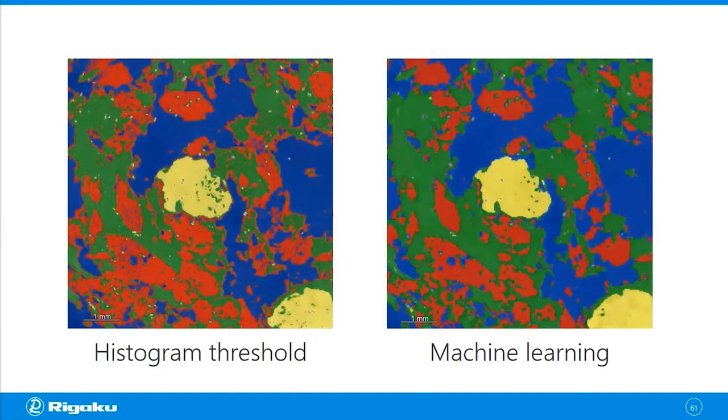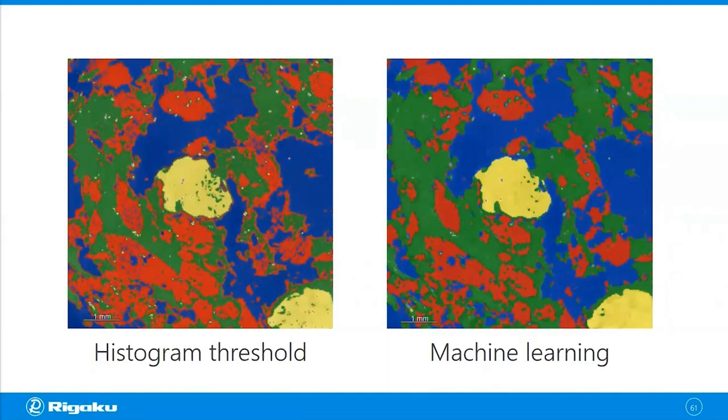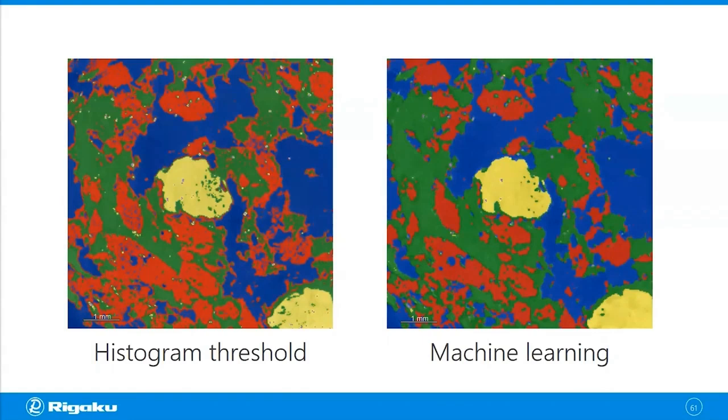When you do the histogram threshold-based segmentation, you get a decent result. But you see a lot of noise-like speckles. And another thing you see is weird framing of different phases.